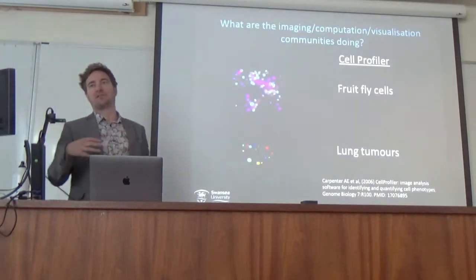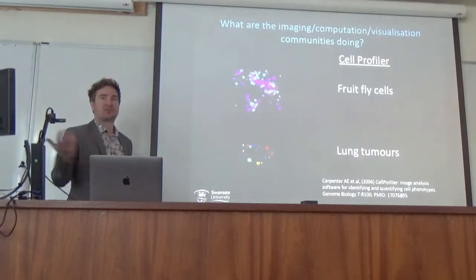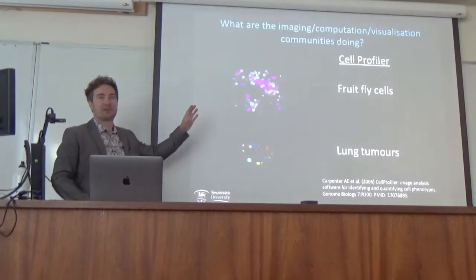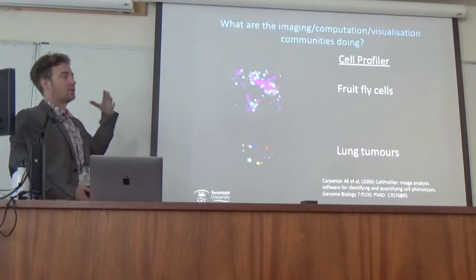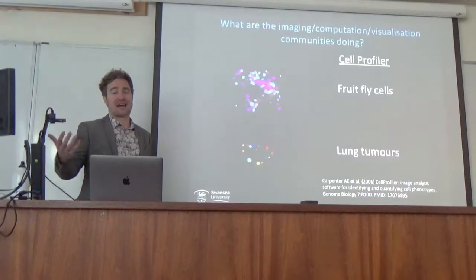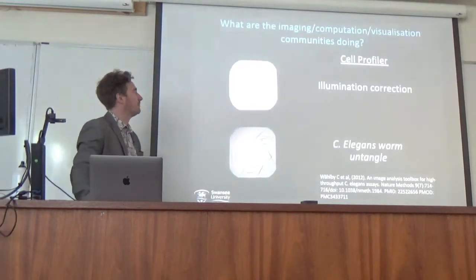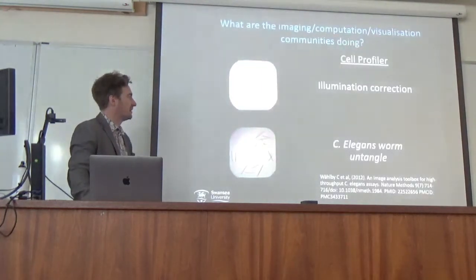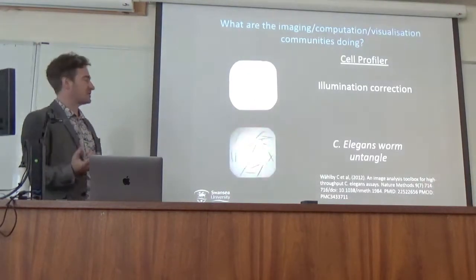But the idea behind this software is that it simplifies that pipeline and makes it repeatable, and that you can show your workings from how you get to one to the other, because ultimately you have your original data, and then you have transforms, modifications, and analyses that you apply to it, and you want to be able to show that process and repeat that process. Then there's some nice things to do with correction, which they've put in their software as well. So basic illumination correction, so you create easier edges to pick up if you're segmenting. And then they have a load of modules for C. elegans, which is a model organism, so loads of researchers are looking at that.